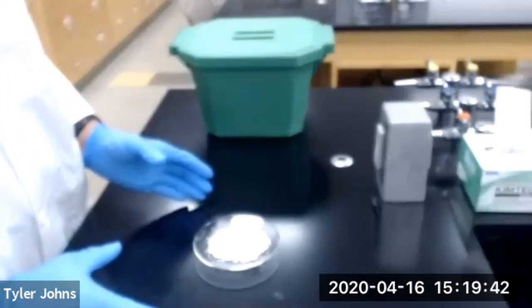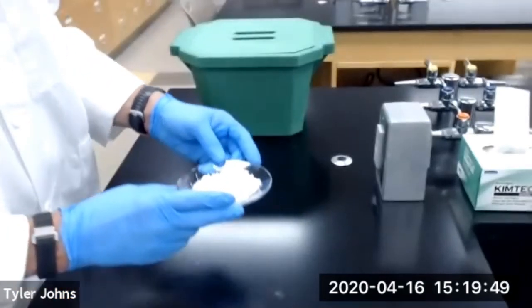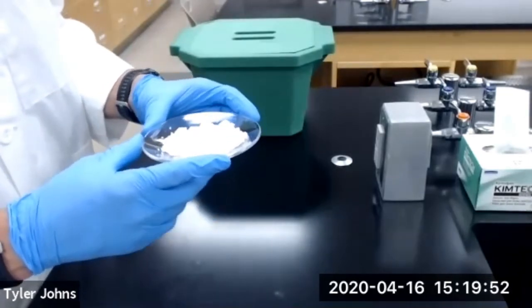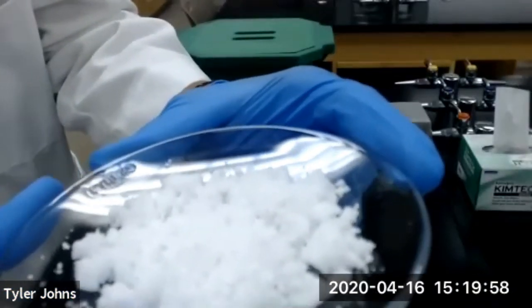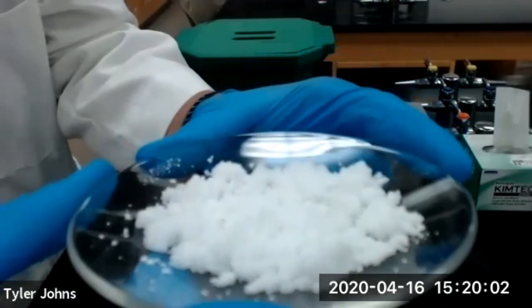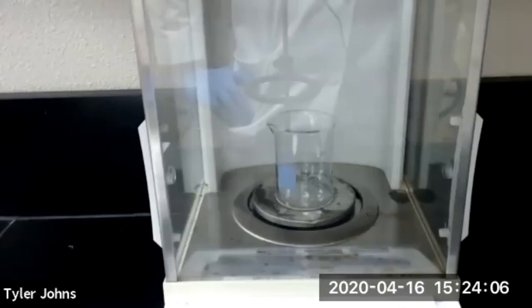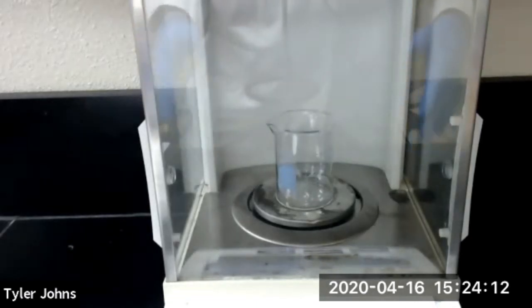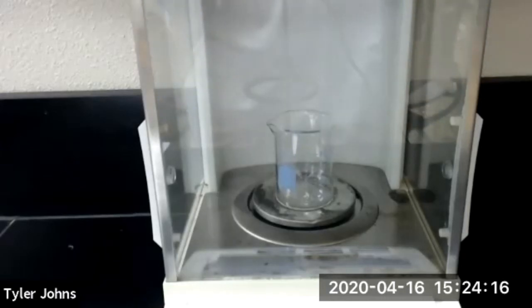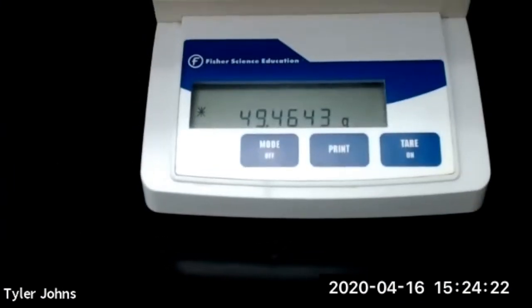After filtering, I've gone ahead and transferred my alum crystals to a watch glass and I'm going to let them dry before I determine the mass recovered of the alum. You can see the alum crystals right here and we're just going to let this dry. As our alum is drying, we're going to go ahead and pre-weigh a 100 mL beaker. The mass of our beaker is 49.4643 grams.